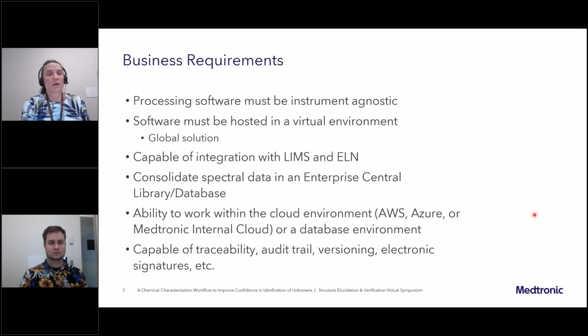Our business requirements were that the processing software was required to be instrument agnostic, and that the software had to be capable of being hosted in a virtual environment. We had specified at the time that it had to be Citrix and also able to be hosted in the Horizon View environment.